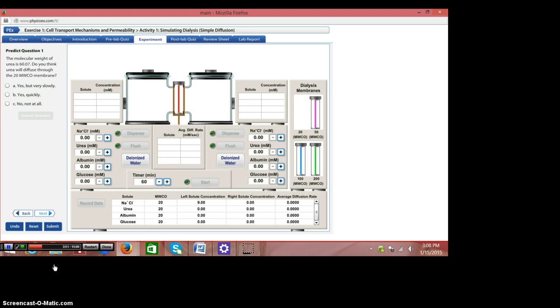Pretty low numbers though. There's a 0.015, there's a 0.0273, a 0.0094, and a 0.0042. So I'll just let you know those numbers. You don't know exactly where they go until you run the experiment, but if you're seeing those numbers, those are correct, and you just need to put them into the right place onto the chart.